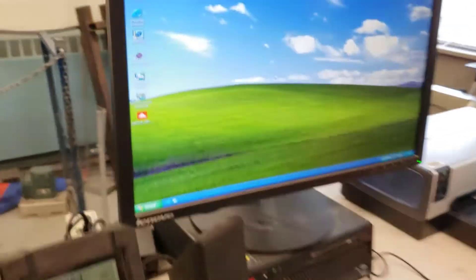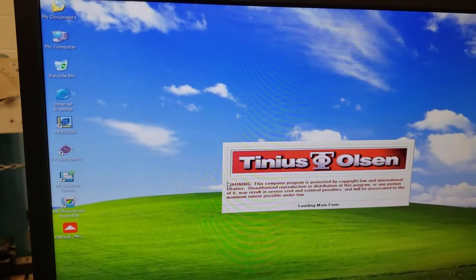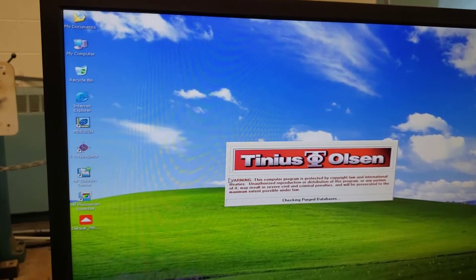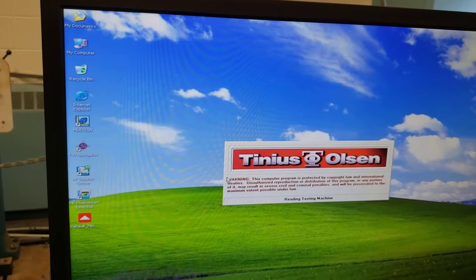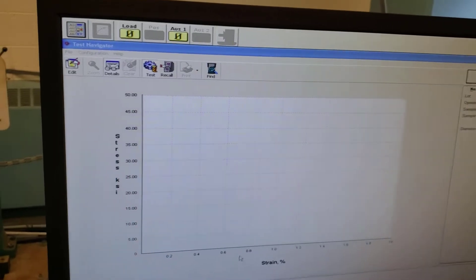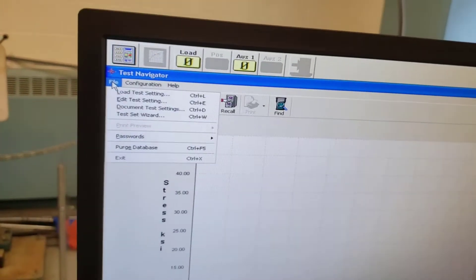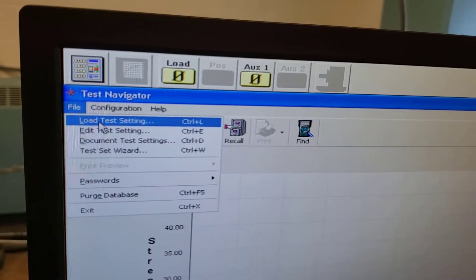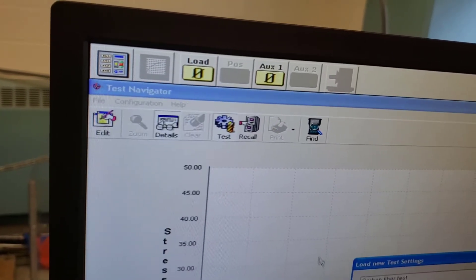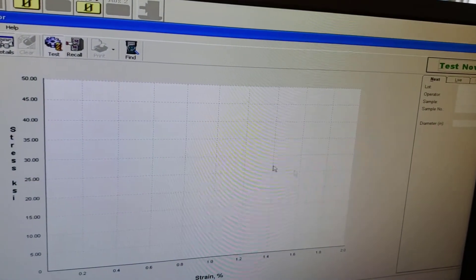The software — if we look at the computer, this TO Navigator — should be up and running for you. Your instructor should do this just in case. It takes a few seconds to load; this is Tinius Olsen's data collection software. You can see we have a stress-strain curve already ready to go. If the test is not set up, you can go File > Load Test Settings. This looks like it's set up for steel — I can load test settings and select HVCC Metal Tensile.